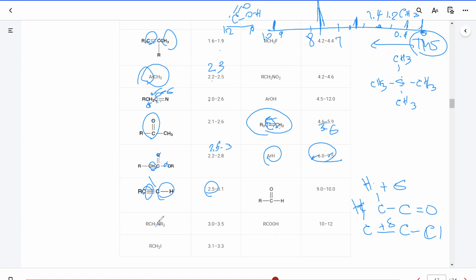For CH2 that is attached to nitrogen, directly attached to the nitrogen, that's an electron withdrawing group. So just like chlorine or oxygen, this also is going to show a higher number. For oxygen, it was 3.5 to 4. For nitrogen attached to this carbon, it is between 3 and 3.5. An electron withdrawing group on the same carbon, whether halogen or oxygen, is going to increase that number, 3 to 3.5. So if you know these numbers, then you can identify your unknown.